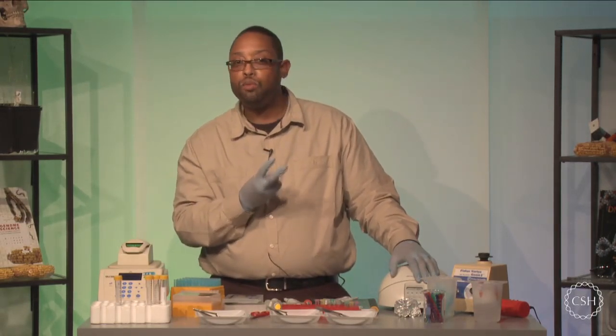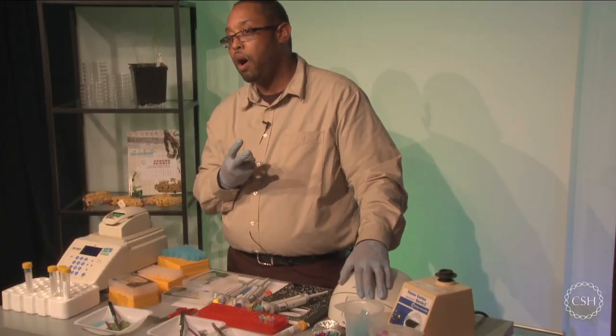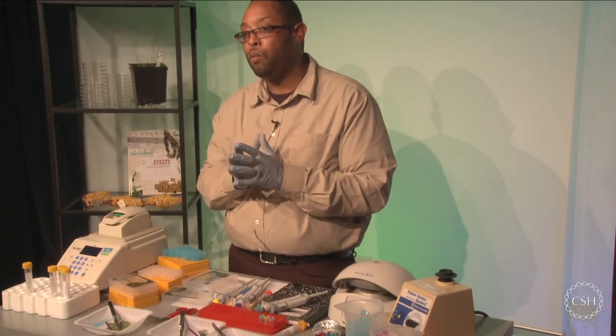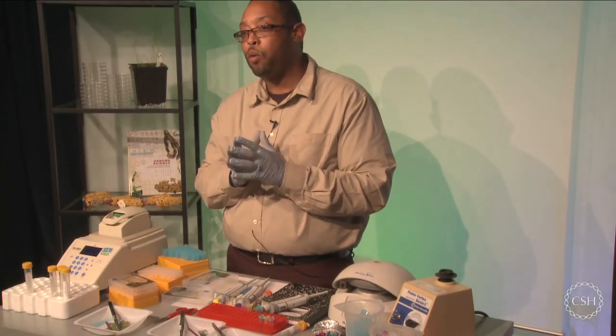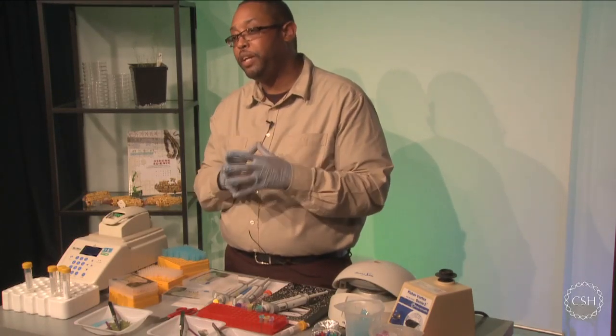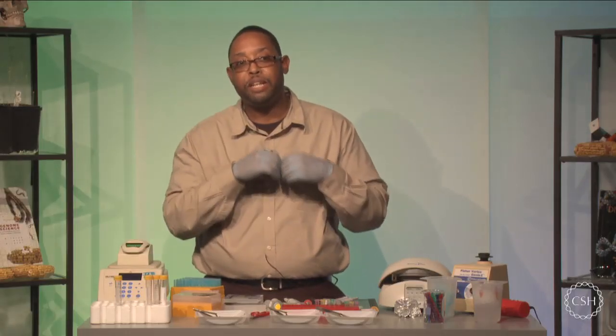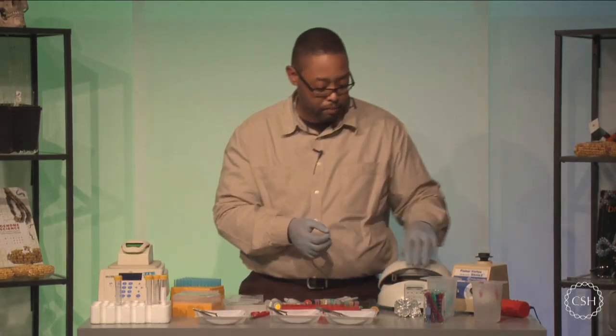You may have to do 2 rounds of spinning to ensure that you get all of the wash buffer physically off, because we don't want any of the alcohol inside of the wash buffer to be still around or present. We want to make sure that it's as free of alcohol as possible during the elution, because that will allow you to get the greatest amount of DNA yielded at the end.